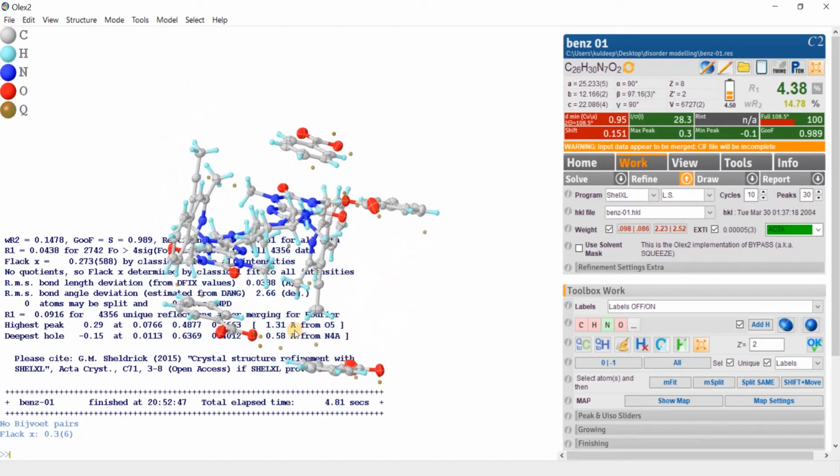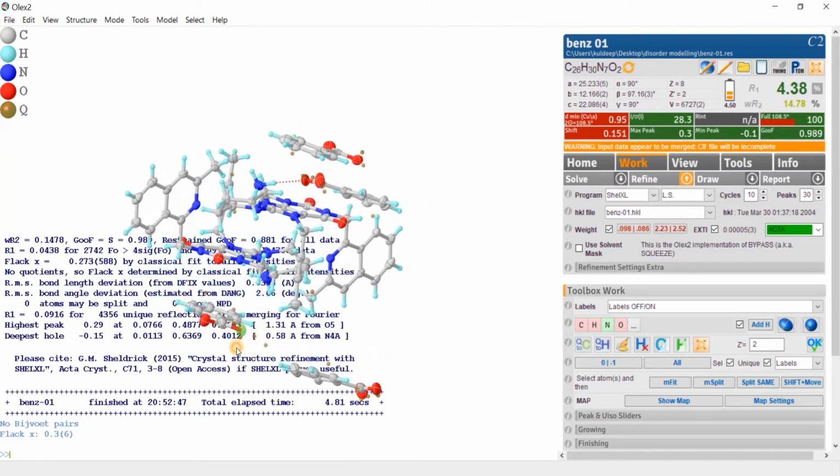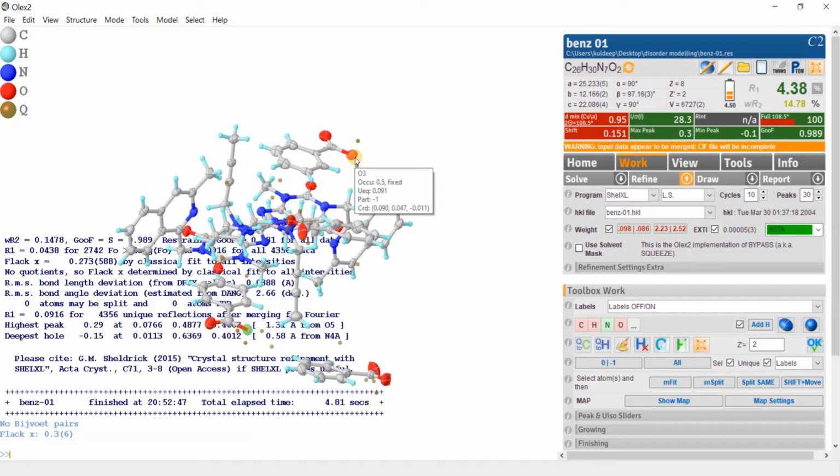Okay, so this is part -1. So there should be hydrogen, half hydrogen, and another molecule is here. This is in part -1. Yes, so 1 and half, half hydrogen should be there. Half hydrogen is there and half is there.